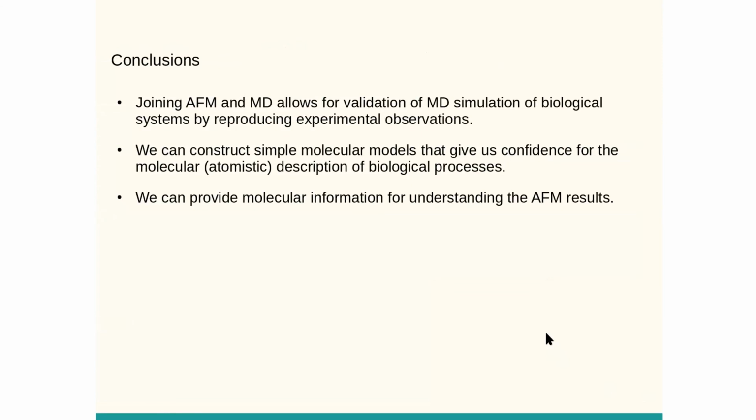We think that joining AFM and molecular dynamics is very important for validation of MD simulations of biological systems, that in many cases you don't have the possibility of comparing to experiments. And here you produce the experimental observation that you expect to reproduce with the molecular dynamics.